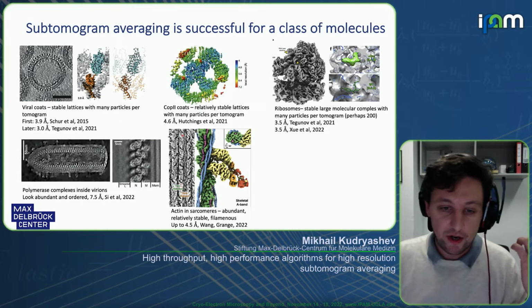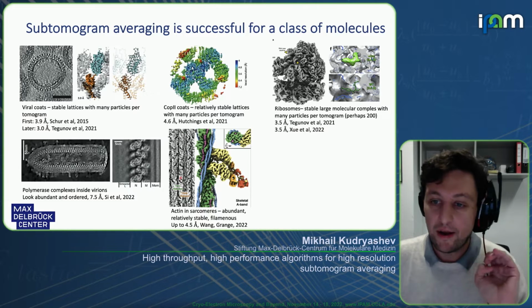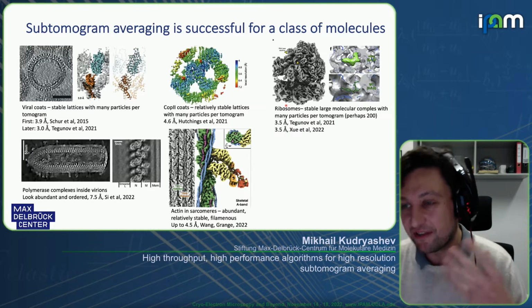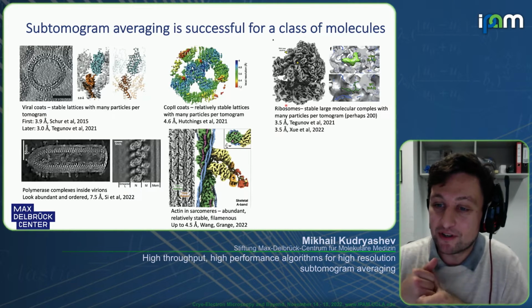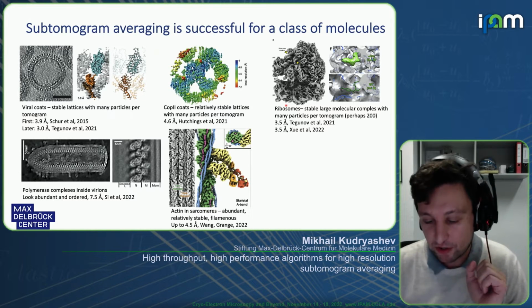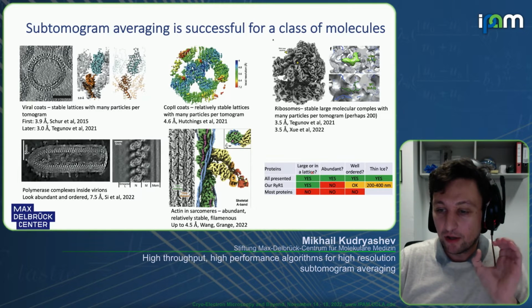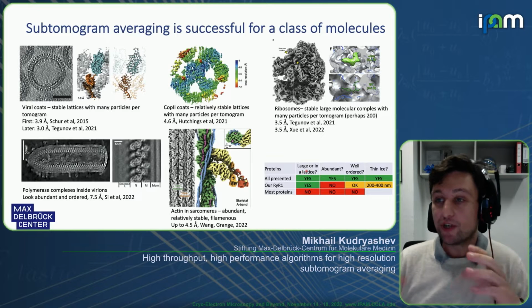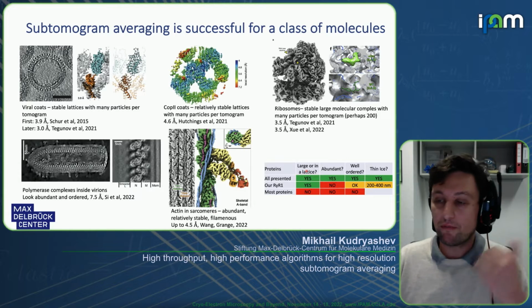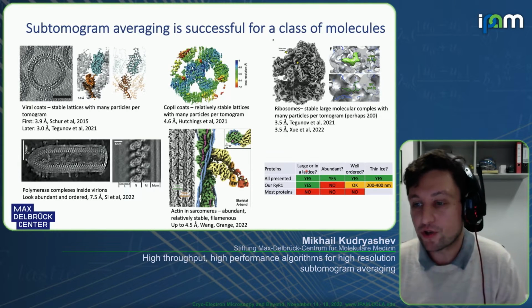They could be in a filament, like in the beautiful papers from Stefan Raunser's group, or several outstanding papers from Julia Mahamid and Dmitry Tegunov, also with ribosomes in them. What they all have in common is that they are large or form a lattice, which helps to align the particles. And then Chris Russo went into details about the potential lower limit for in situ structural determination.